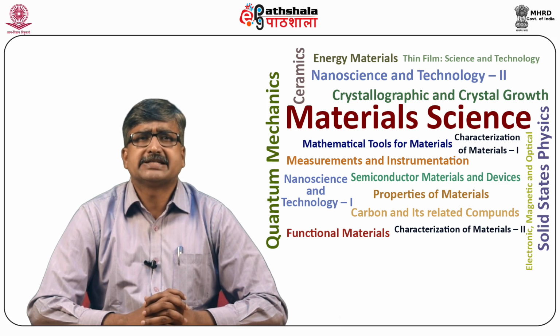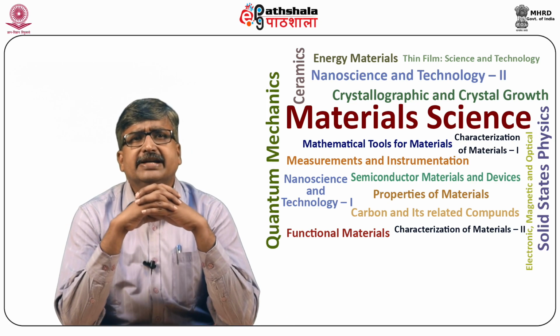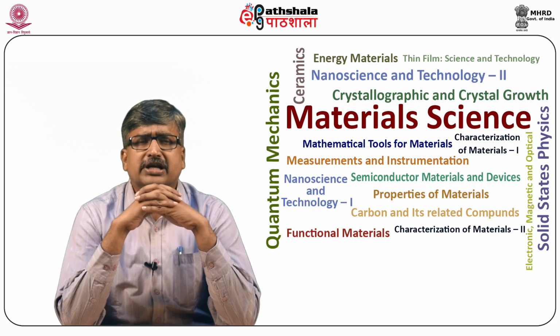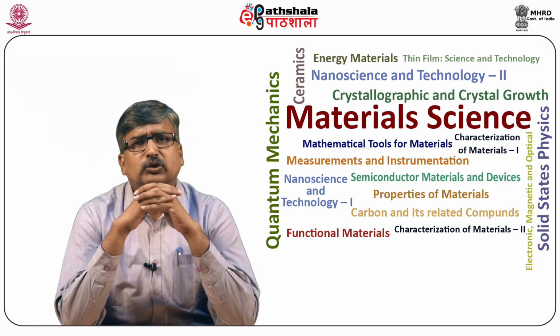Detection in CE will be discussed in this slide. The most common mode of detection in CE is on-capillary detection. In CE, the migration velocity of each solute through the capillary is a function of its electrophoretic mobility in conjunction with the electro-osmotic flow (EOF). Since detection occurs on the capillary, these forces are operative as the solute is transferring through the detection window. As a result, slower moving components spend more time migrating past the detector window than their more rapidly moving counterparts.